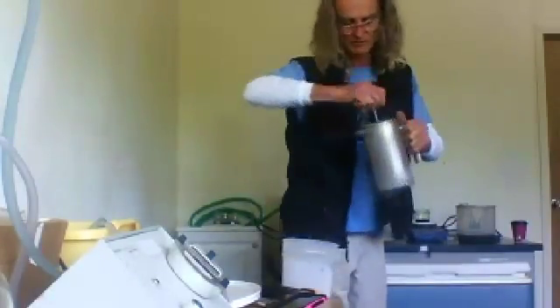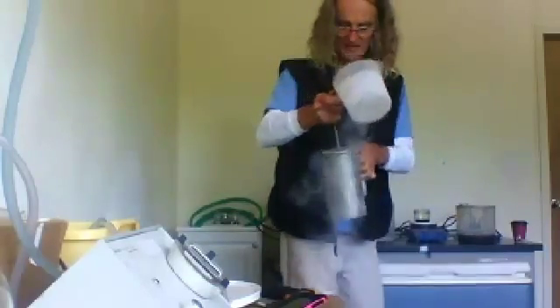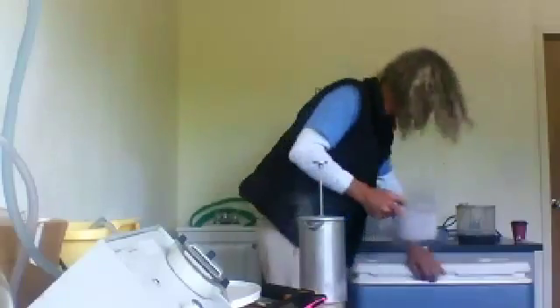Okay, we're just pouring a little bit of liquid nitrogen in here just to take down the temp. That's it. And what we're going to do is we're going to be filling these with plant material.